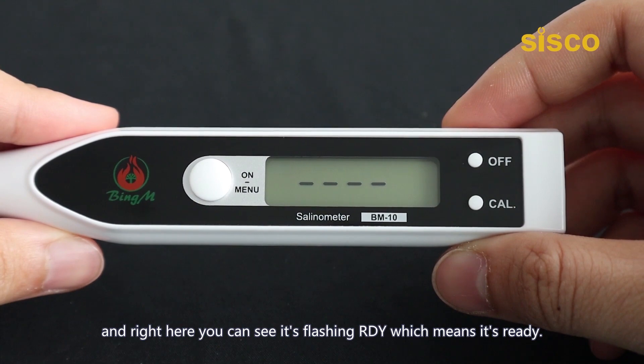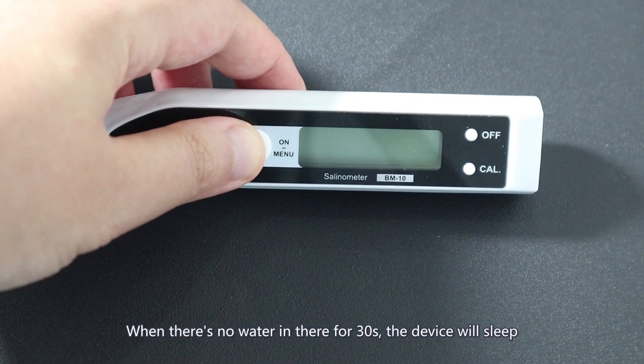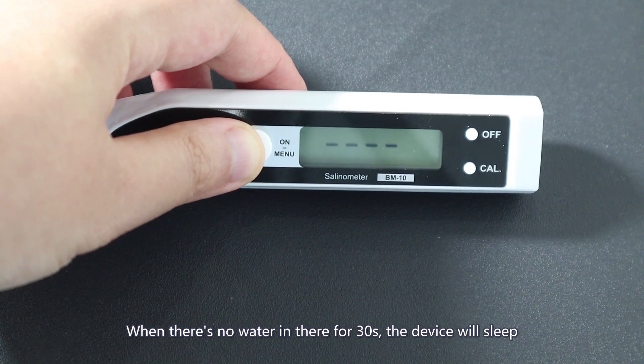Right here you can see it's flashing already, which means it's ready. When there's no water in there for 30 seconds, the device will sleep.